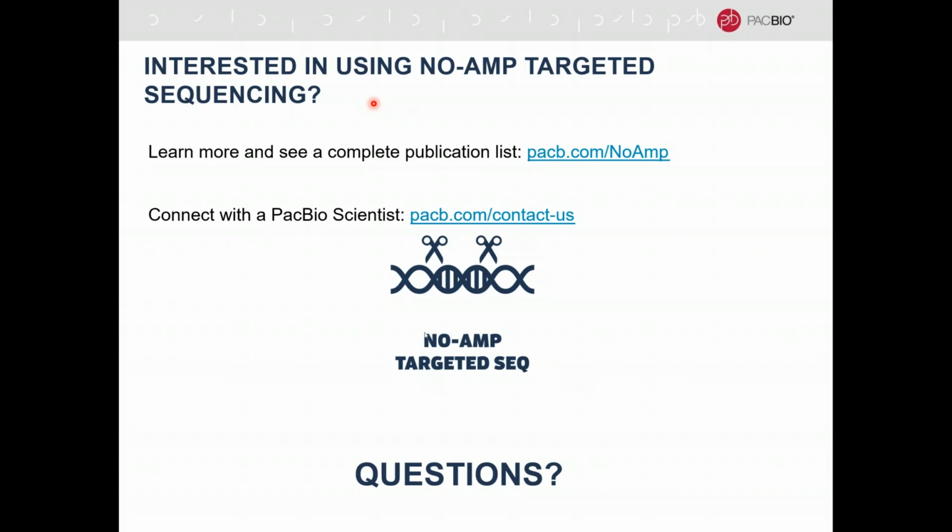Going forward, one of the things we can look at is continuing to develop validated guides and maybe create a panel, but that's not on our current view right now. CRISPR-Cas9 is such a broad and enabling capability that we really want to get feedback from you on where we should go. And overall, as we've mentioned, the success of designing guides and having them work well is pretty high.